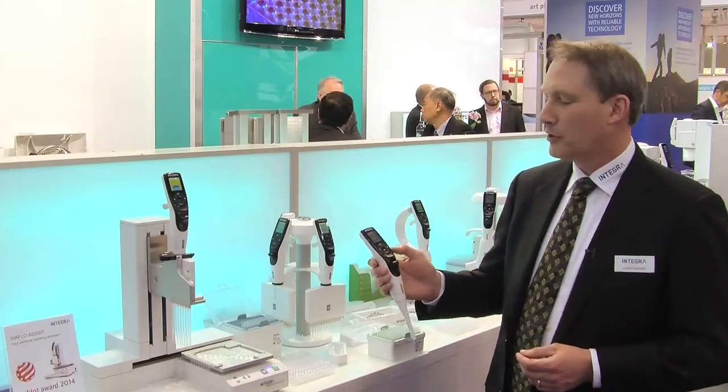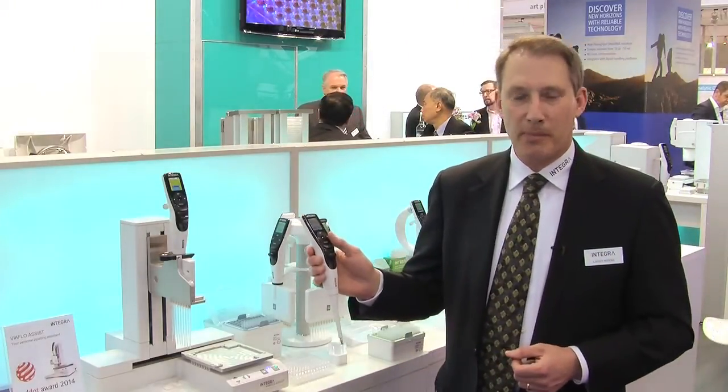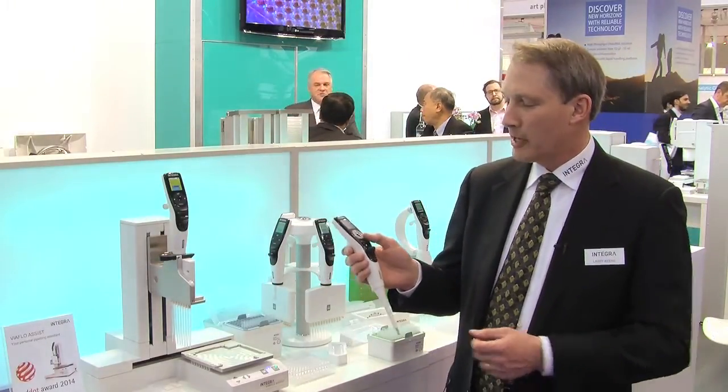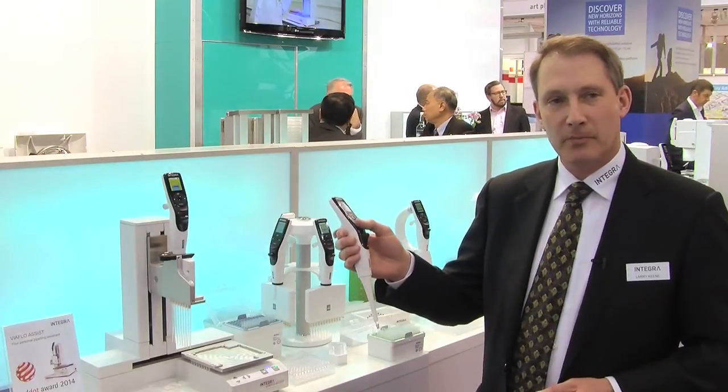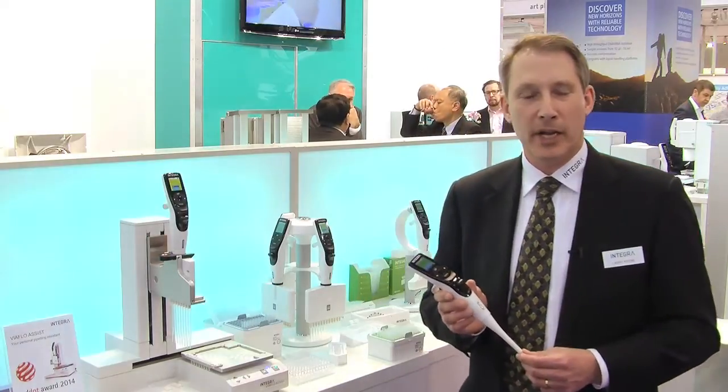The other thing that we worked hard on is our interface for our pipettes. Ergonomically, we've got it set up so we have a very small motion in terms of our thumb to do the programming, the run of the program, and the ejection of the tips themselves. Again, this technology works on everything we have.